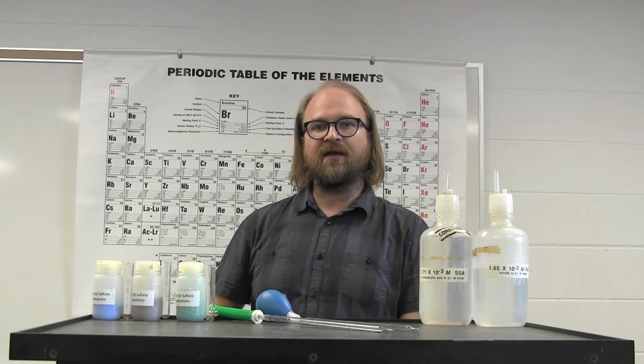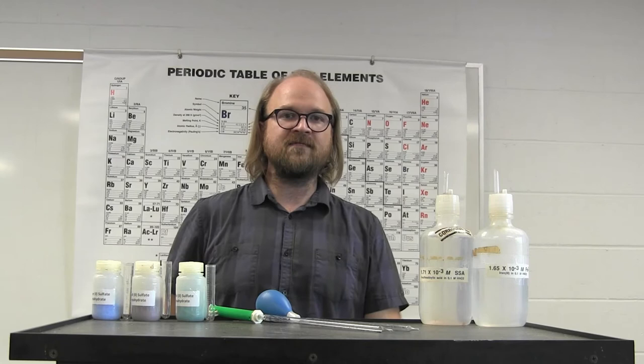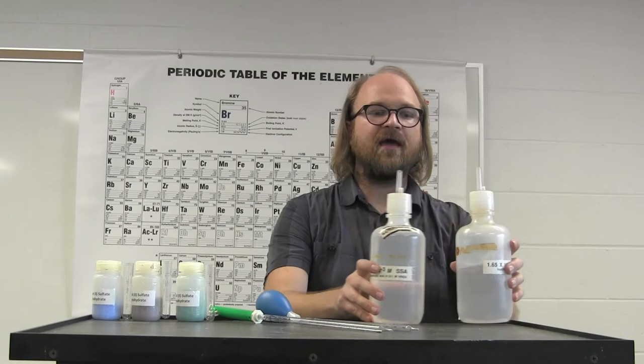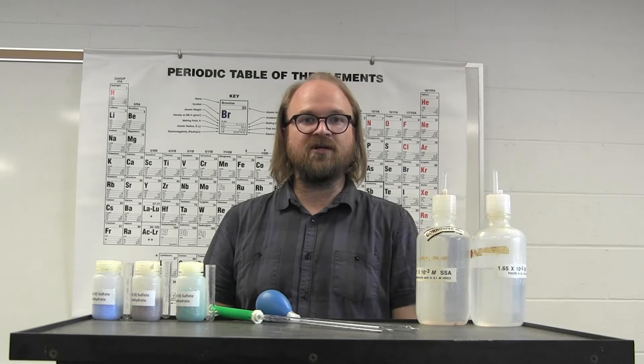In this lab, you're going to be preparing solutions both from solid compounds as well as looking at dilutions, looking at taking different solutions that are already prepared and mixing them with each other and mixing them with water to dilute them and determine what is the final concentration after the additional volume is added.